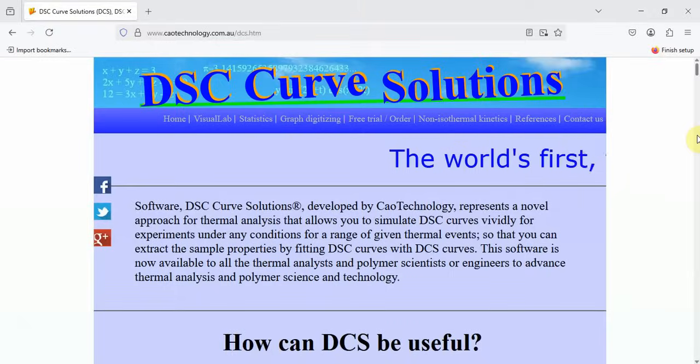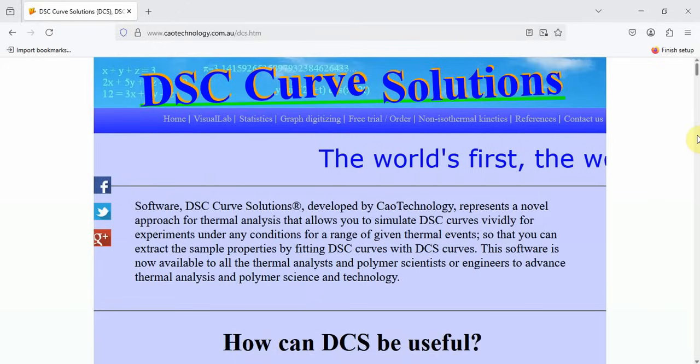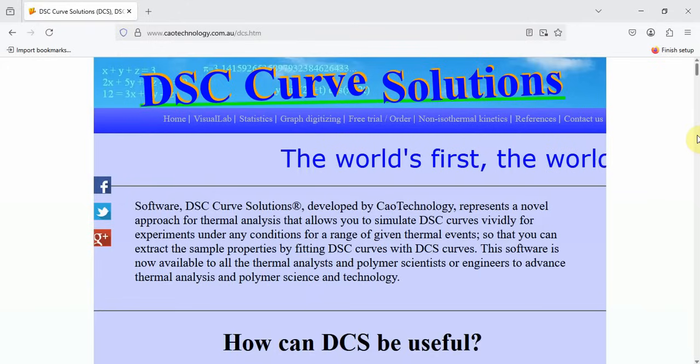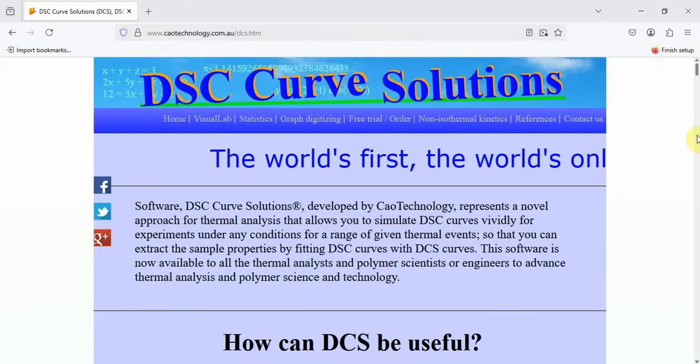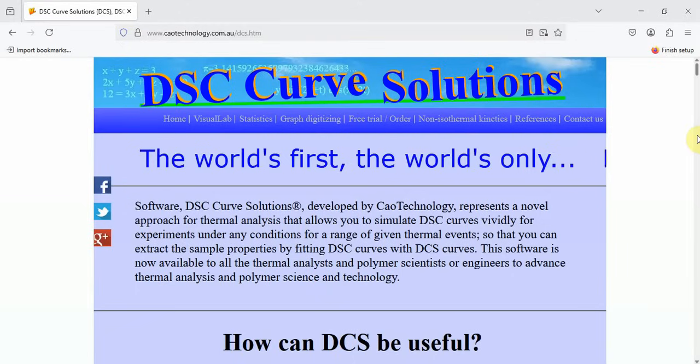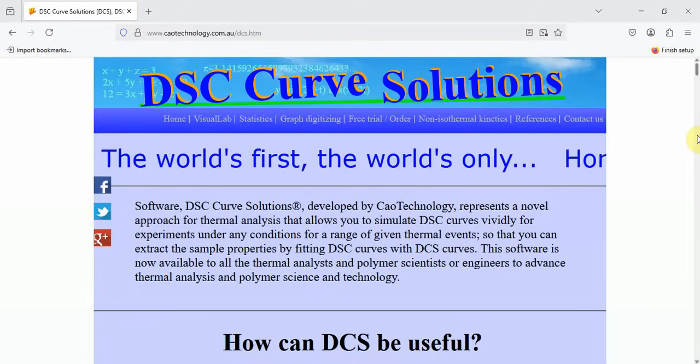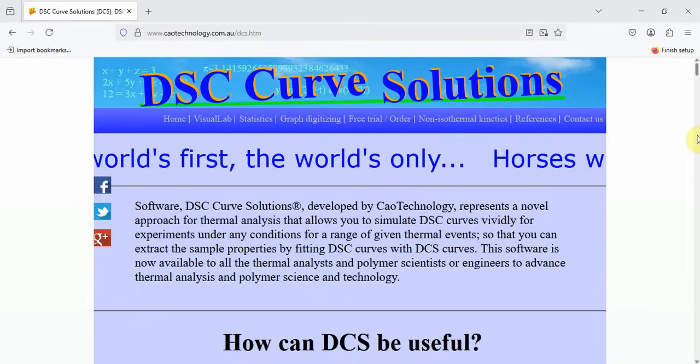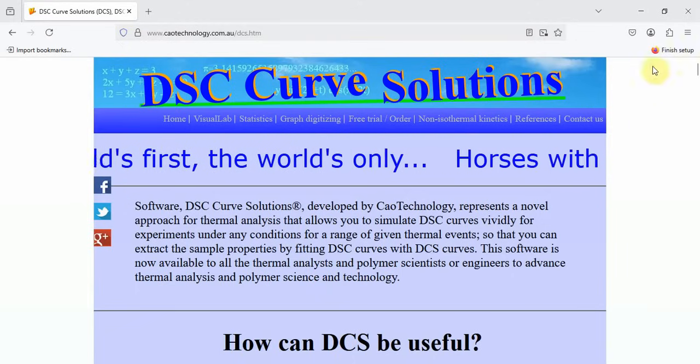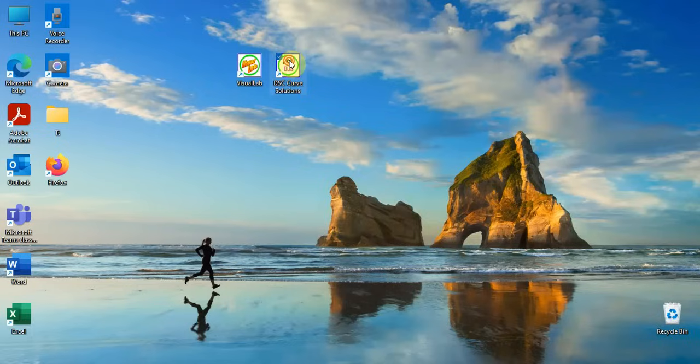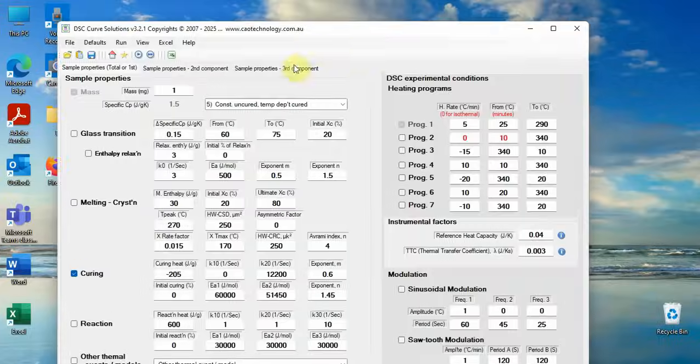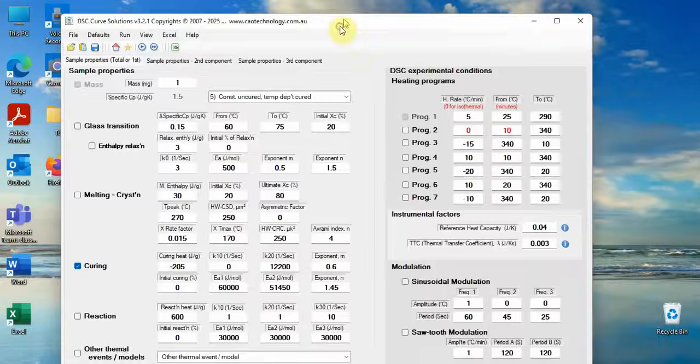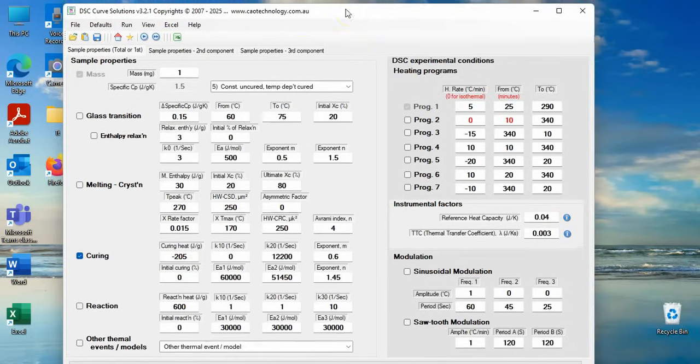DSC Curve Solutions is a computer application simulating DSC curves of any actual DSC experiments. This video is a brief demonstration showing how DSC Curve Solutions works.